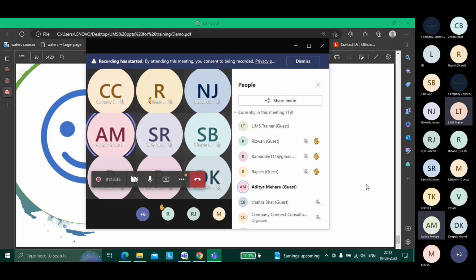It's not about fast. It's about understanding. See, that's what, right? It's not about how I can create fast. No, let me complete. It's about understanding in LIMS what flags are what, where I'm clicking, when I'm clicking this, what is happening, why I'm clicking here, so that you take your decision and you prepare it the fastest way. Got it? A consultant knows why he's clicking this, why this tool is working.